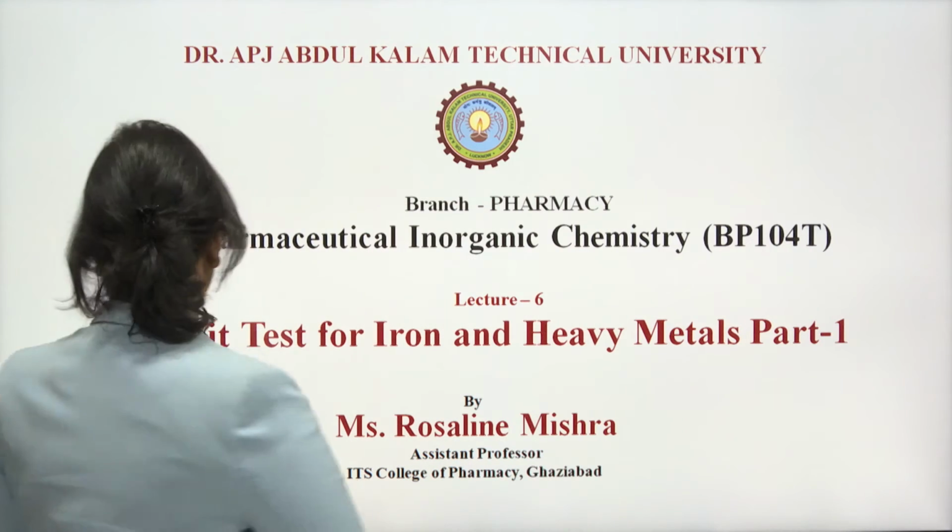So in our previous class we were discussing limit tests. In today's class also we will continue with our limit tests. We will discuss the limit test for iron and heavy metals.